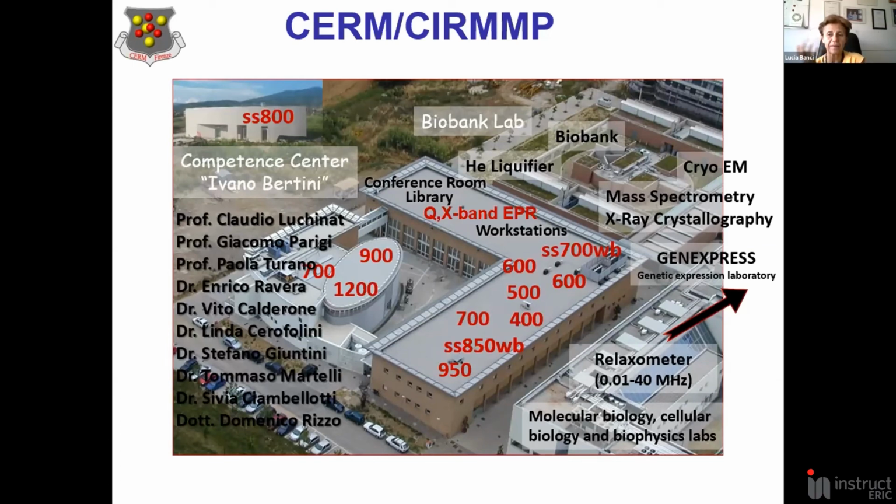One comment I can ask you is just how general do you think this approach would be? So probably the main criticism could be that we have used in many cases the E. coli asparaginase. What I can say is that we have collected good results with many different proteins. Sometimes the quality of the spectra is an issue, while it is good when you have a small and flexible protein.